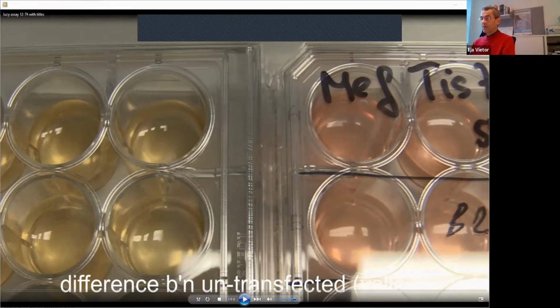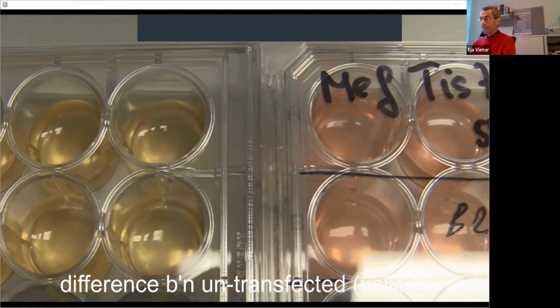So this is the beginning of the next procedure, which is done 2 days later. Here I put next to each other 2 different plates. So on the left side, you see not transfected cells. On the right side are transfected cells. So what is the difference between these 2 plates? What you obviously see? The color of the medium. Color of the medium, correct.